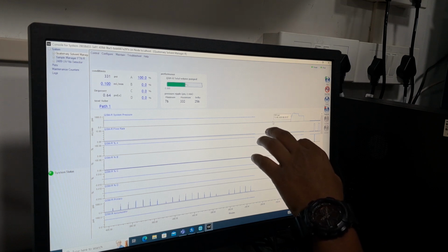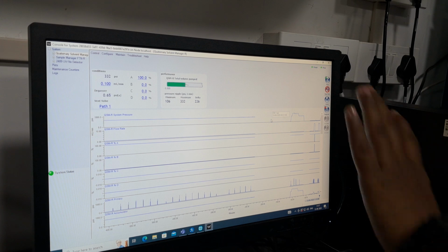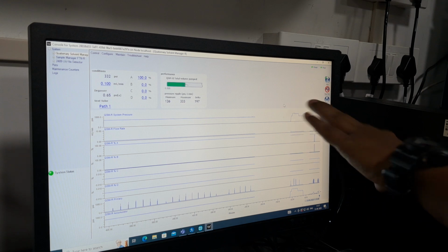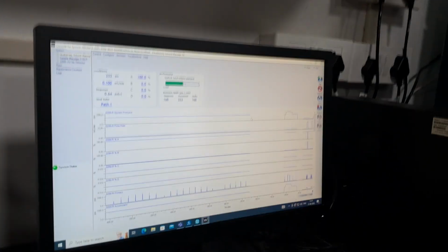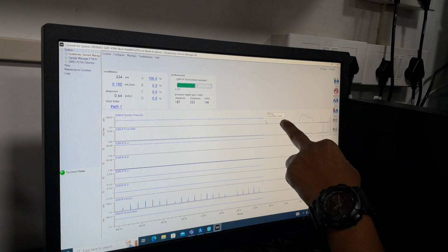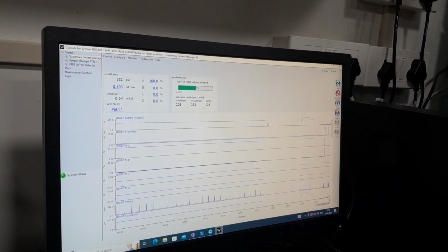After that you can click here. That time there is no pressure. Visual identification will be useful. So what does this window indicate? It was switched off or something? Some error, a communication failure. And what is the time it is showing? Yes, it is showing 7:36 today, right? Yes, today.